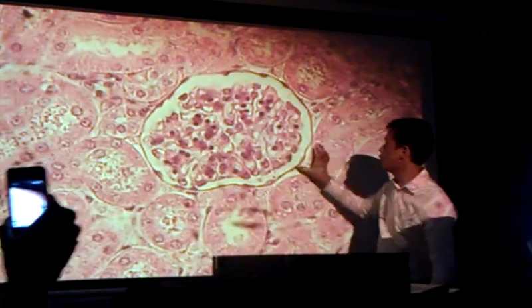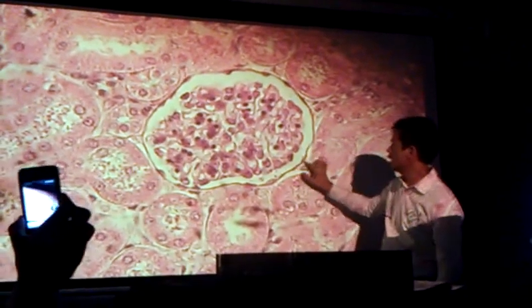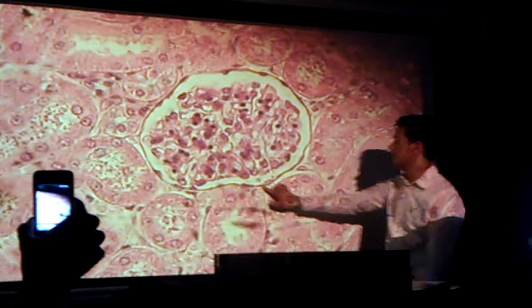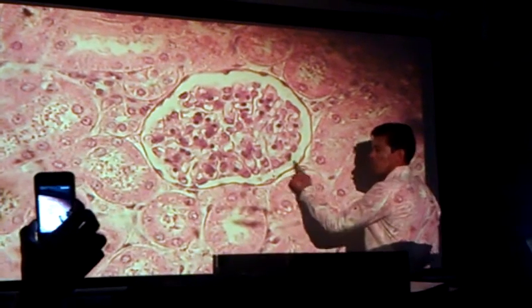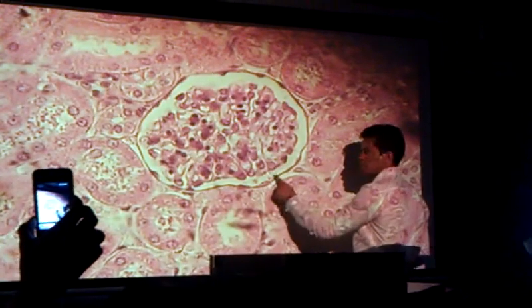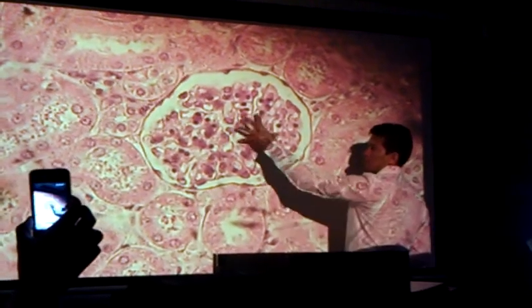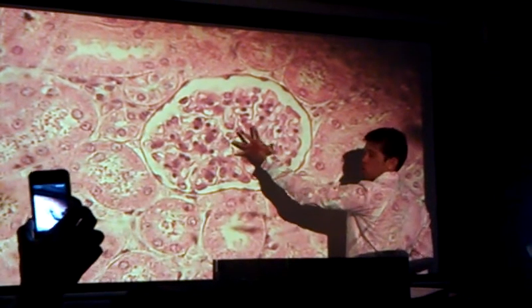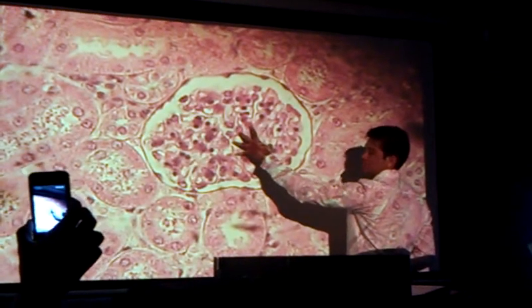This is Bowman's capsule right here on the outside. This space here — that's Bowman's space. And this big blob right here is your glomerulus.